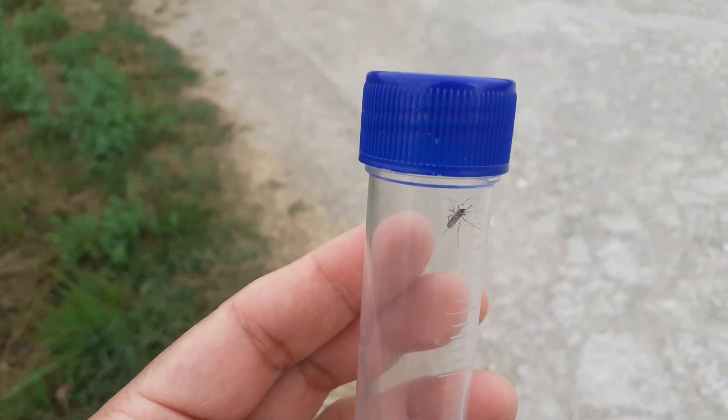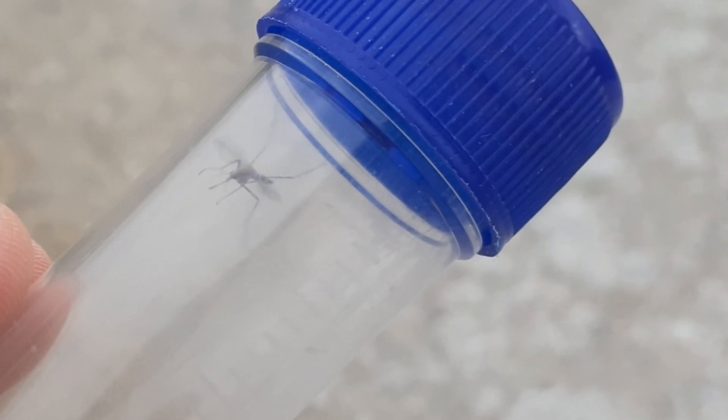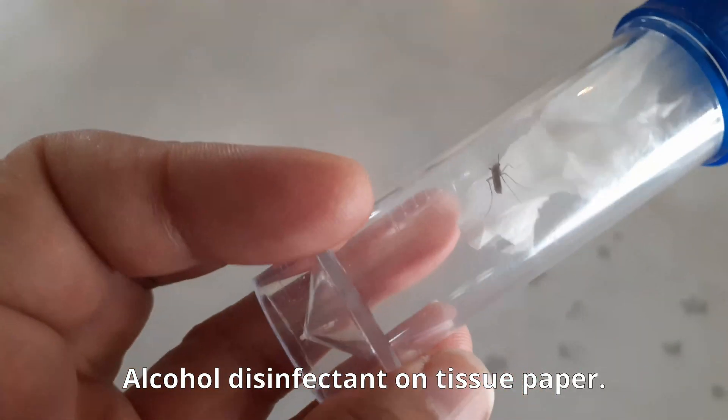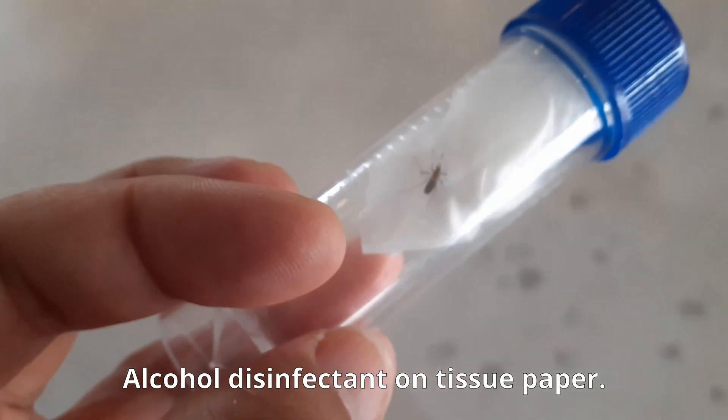The question is how do you take a mosquito home so that I can prepare it and make a permanent mount, which I'll show towards the end of the video. I don't want to transfer species from one region to a different region — you shouldn't be doing that. So what I'll do is add a little bit of disinfectant, which contains alcohol, and this is going to kill the mosquito.